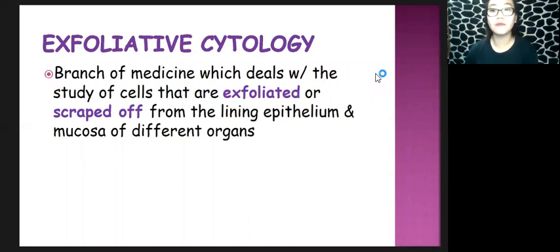So this is the last video that I will be giving for histopathology. And for this video, I will be discussing exfoliative cytology. I hope you can still remember the process of exfoliation from your histology or probably from your anatomy and physiology, because it is something that we have discussed already in the past in your other subjects, so that you would be able to understand your exfoliative cytology.